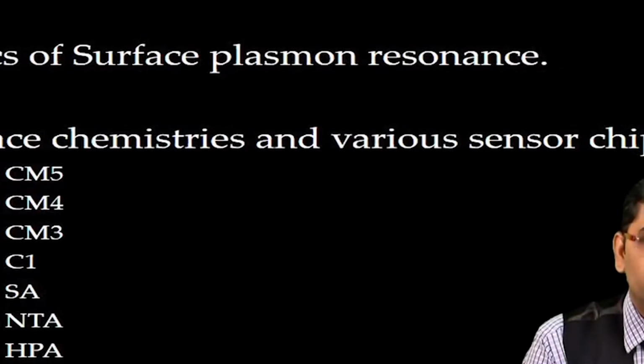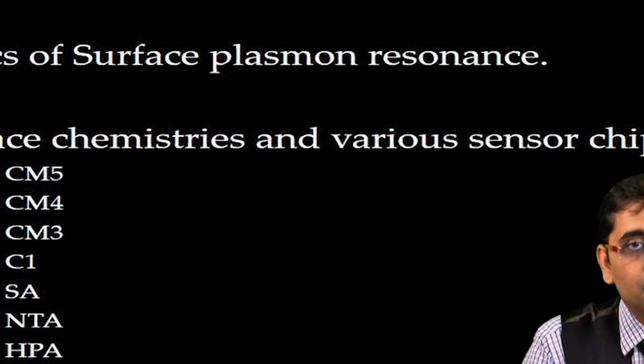Welcome to MOOC NPTEL course on Interactomics. Today we are going to talk about basics of surface plasmon resonance, SPR, with focus on surface chemistry.